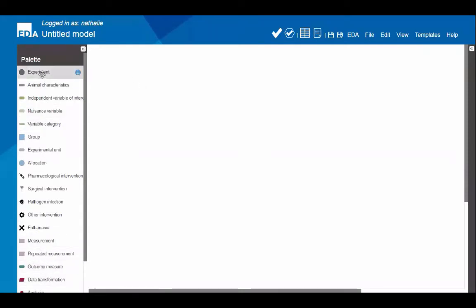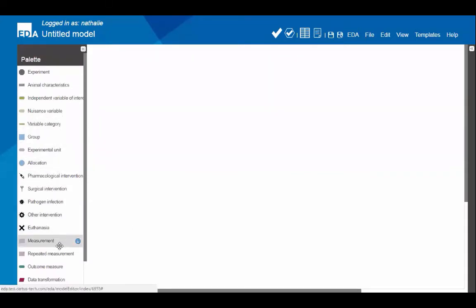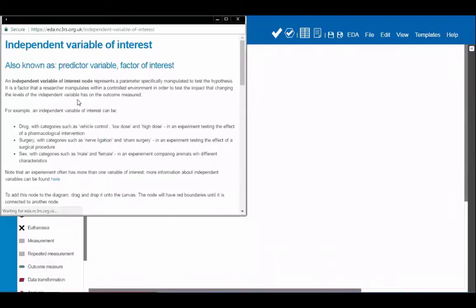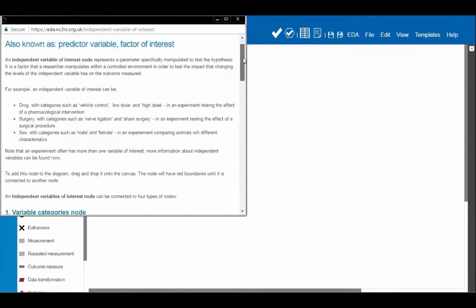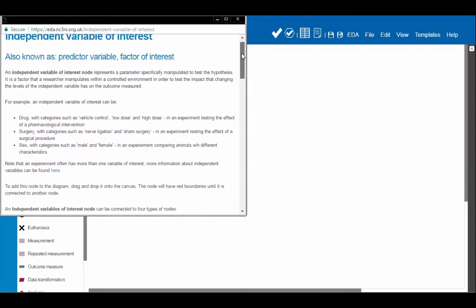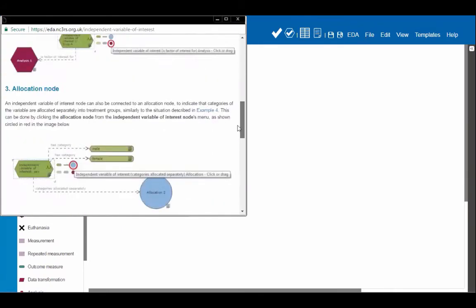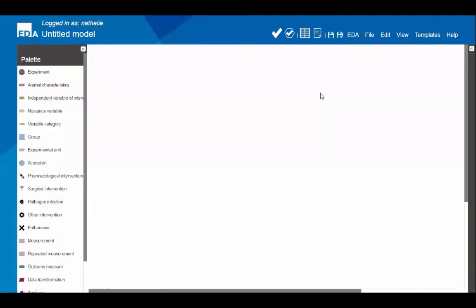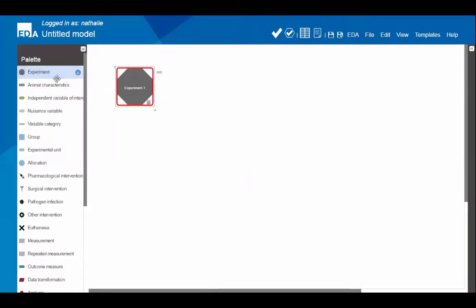Starting from scratch, I'll reproduce the two-group comparison diagram I showed earlier. On the left-hand side you have the palette with all the nodes you can use to build your diagram. As you hover over each node, you get a little blue icon to access the information box with more details about that node. For example, hovering over 'independent variable of interest' shows what it's also known as, its definition, and common examples from animal experiments. You start building the diagram by dragging and dropping nodes onto the canvas.